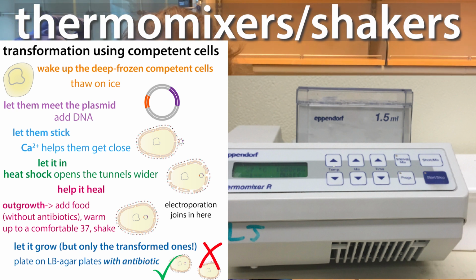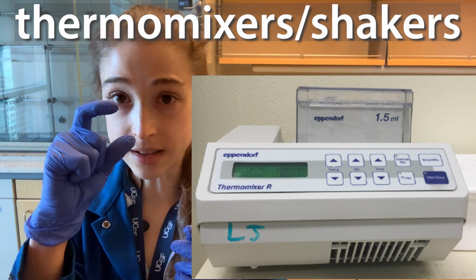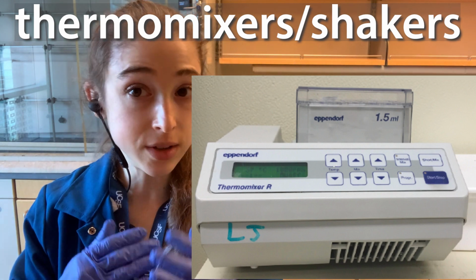But basically, afterwards, you need to let the cells recover in the absence of antibiotic before you then plate them on plates that have the antibiotic that you're using to select for the plasmid. You need to allow them to outgrow a little, like half an hour, depending on the antibiotic. You let them recover in these little tubes in about a milliliter of media, so in their food, and shaking. We often do this on one of the shaker blocks.